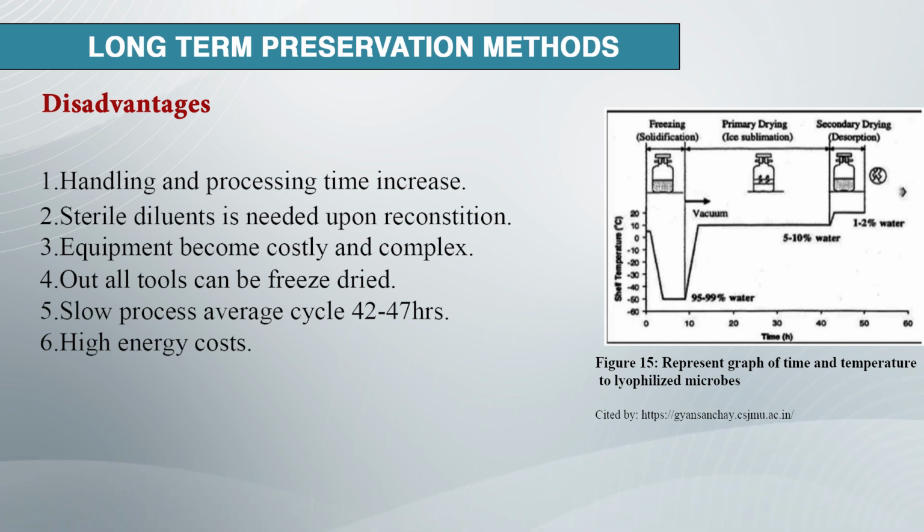Sterile diluent is needed upon reconstitution. The equipment becomes costly and complex. Not all tools can be freeze dried. It is a slow process, average cycle is 42 to 47 hours, and high energy cost.